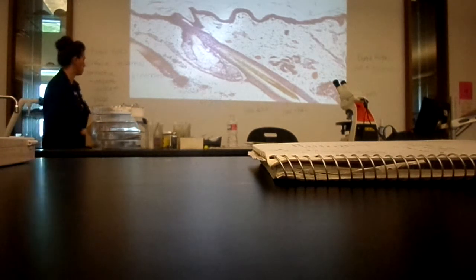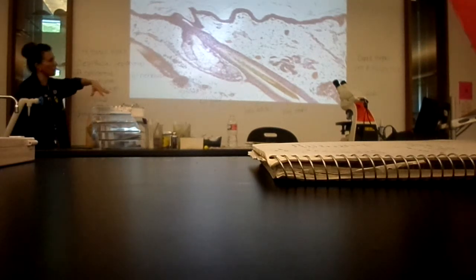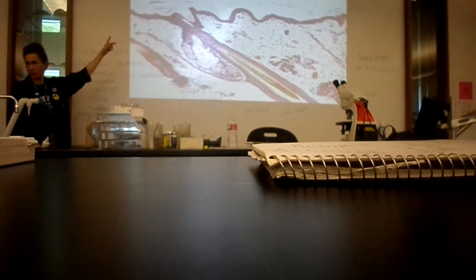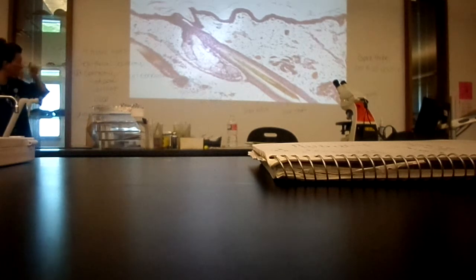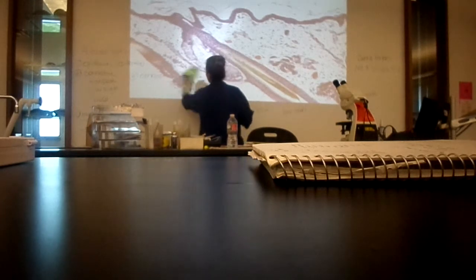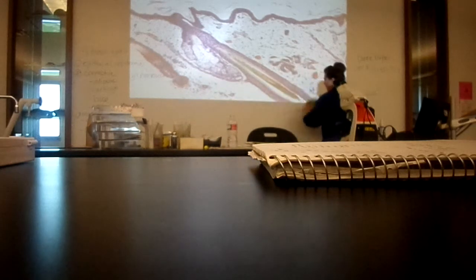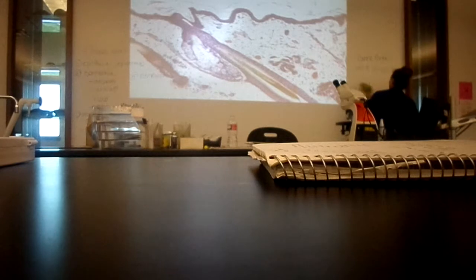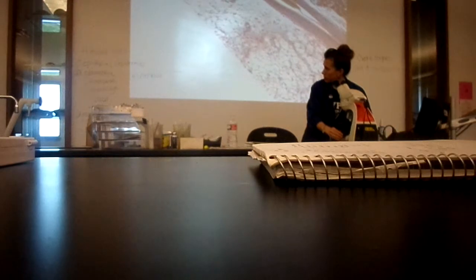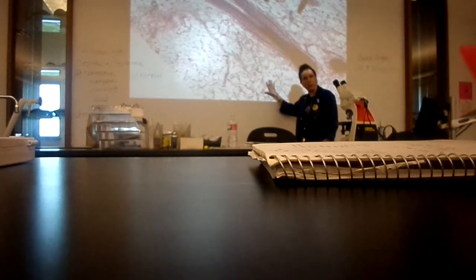We've covered a lot of parts in the skin. We've also looked at one type of tissue, epithelial tissue, that's the epidermis. I forgot one more type of tissue here in the skin, in the subcutaneous layer. So now we're going to move down into the third layer of the skin, the subcutaneous layer, or the hypodermis. All of this tissue here is adipose.